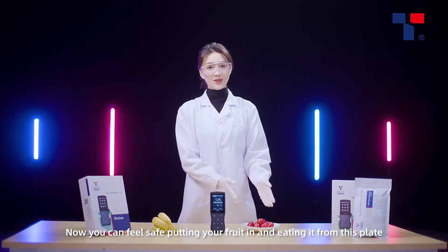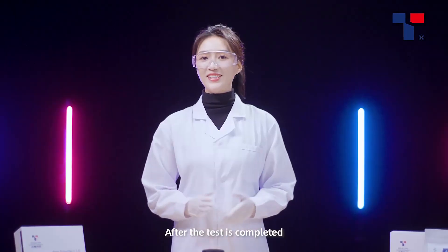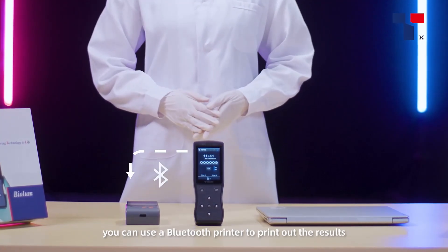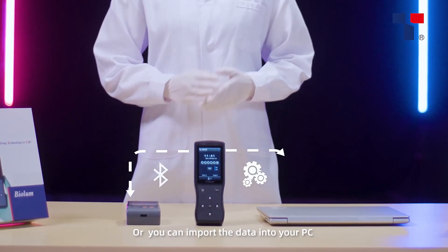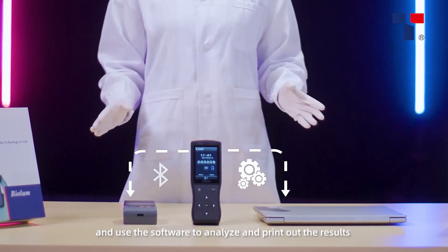Now you can feel safe putting your fruit on and eating it from this plate. After the test is completed, you can use a Bluetooth printer to print out the results, or you can import the data into your PC and use the software to analyze and print out the results.